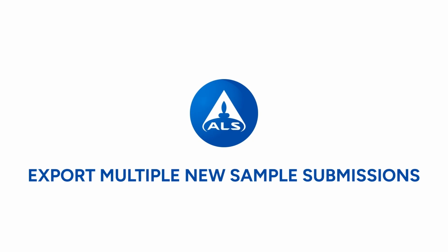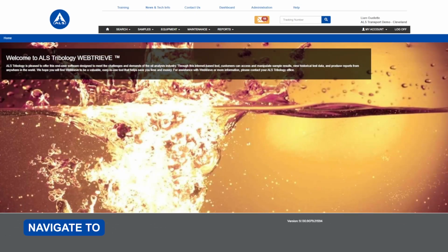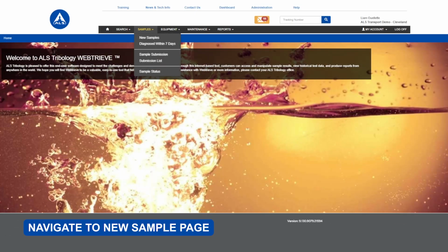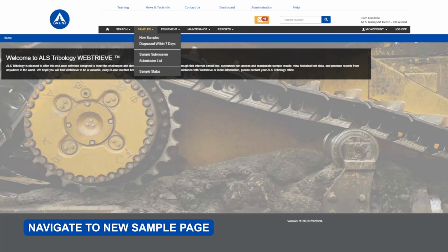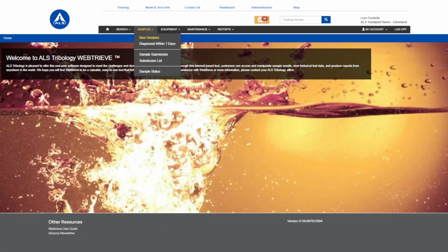In this video, I'm going to show you how to export one or more sample submissions for new samples on desktop. Starting from the home page, you can look up at the top level navigation under the sample item. Hovering over samples will create a drop-down menu, and you can either select new samples or diagnosed within 7 days. Let's click on the new samples item.